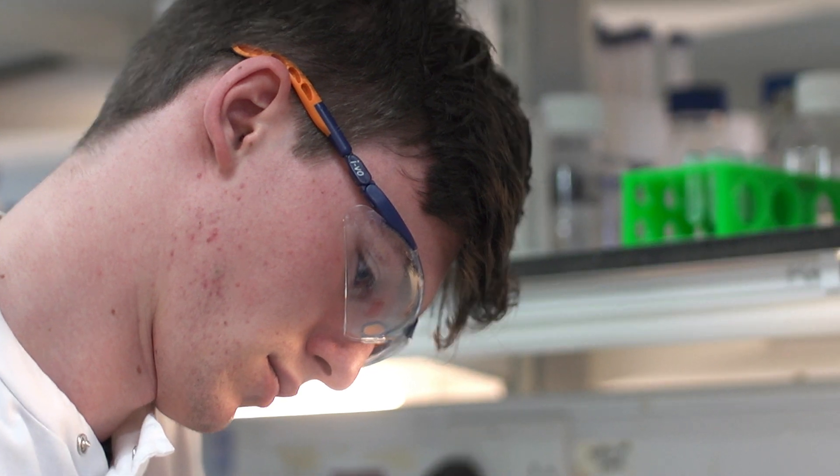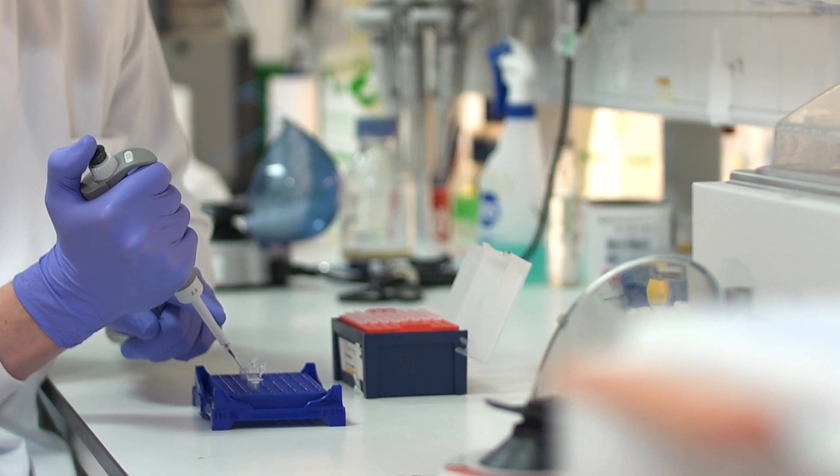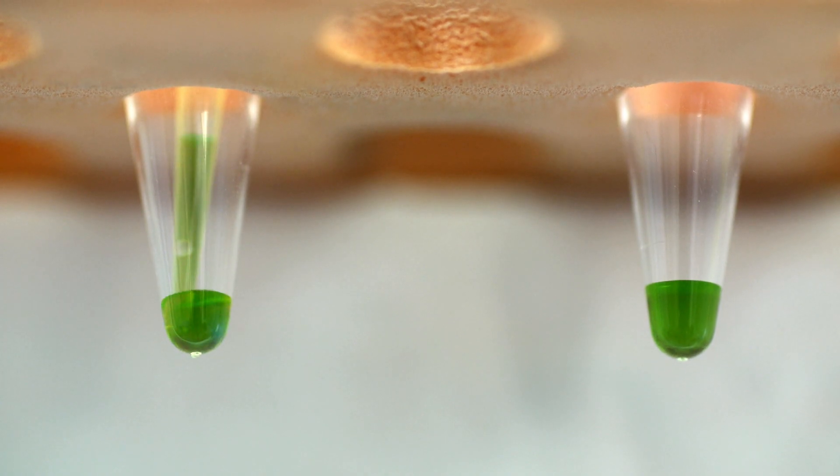Alltech has visual pipetting control which means there's an integrated loading dye in the Alltech already. This allows us to load our samples onto our gel much faster because we don't need to add any additional loading dye and we can track the bands on the gel when we view our results as well.